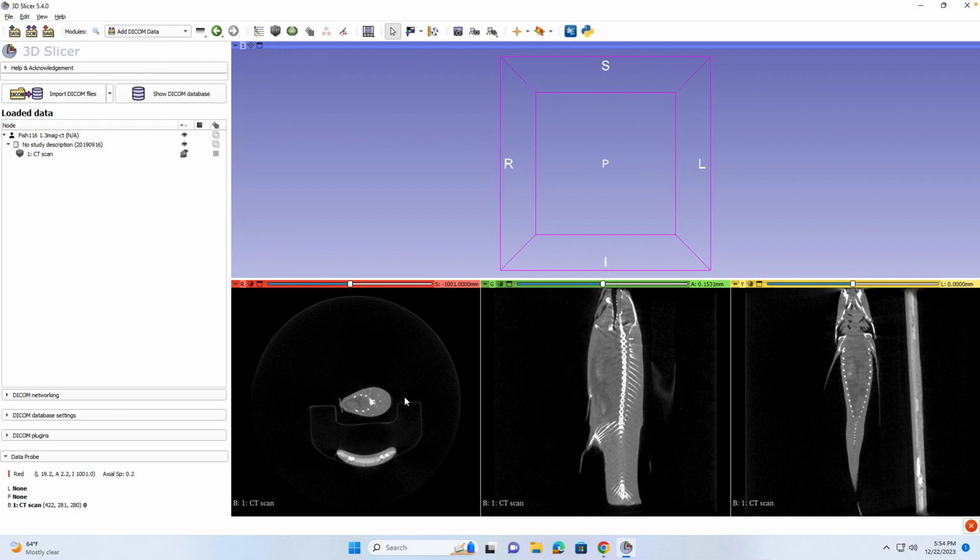And as you can see, you're going to have your 3 different planes right here that are going to be showing different parts of the fish, or different, I guess you could say, angles of the fish and how the image is taken. So it looks exactly the same as when you go to the doctor's office and they give you a CT of your sinus, your head, or whatever you got, and you're looking at different planes, right? He's scrolling the mouse through them, and it's almost like an image just going straight through you, right?